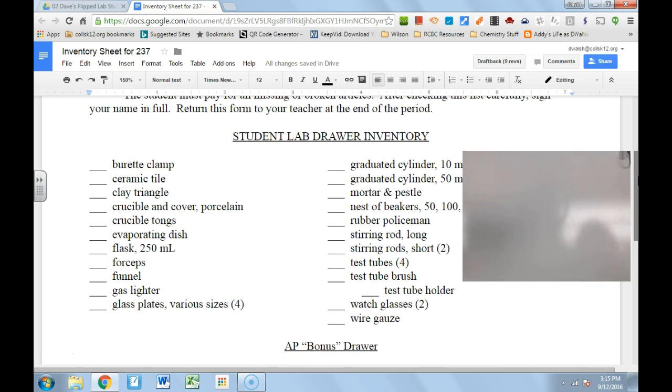The last thing on this list is what we call wire gauze, which is like the screening that's in your drawer. This is good for just putting stuff on when you're trying to heat it up over a Bunsen burner.